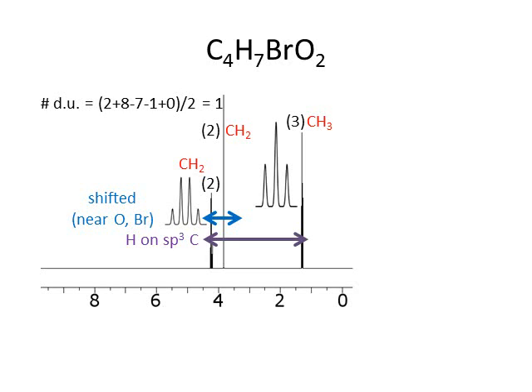What else do I know? Well, this one just looks like a line. I didn't blow it up because it wouldn't show it. It would still just look like a really narrow, very tall triangle. This one's a singlet. But on the other hand here, I've taken this pattern. When you push it down into a small space, it's hard to see, but it's a quartet. If I kind of expanded the x-axis, this here is showing me the pattern of what that looks like. It's a quartet. The same thing here. This one, if I kind of stretched it out, you would see that there's more pattern there. It's kind of shoved together there, but it's a triplet.